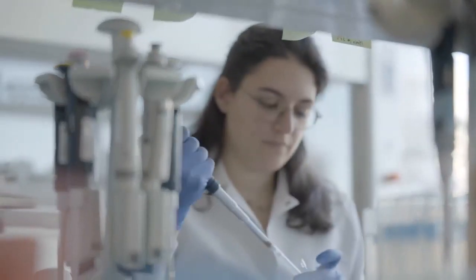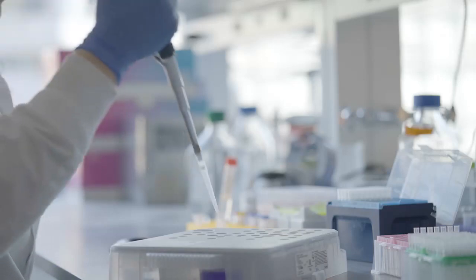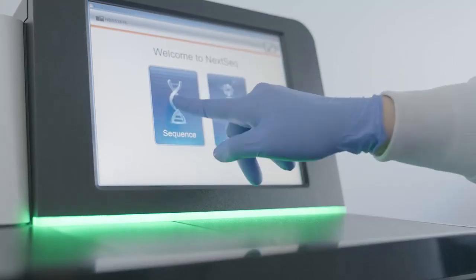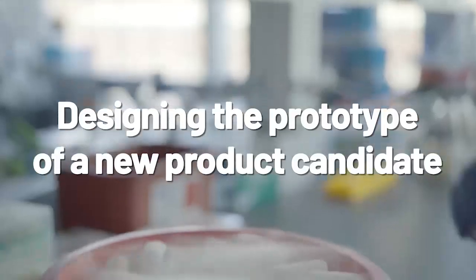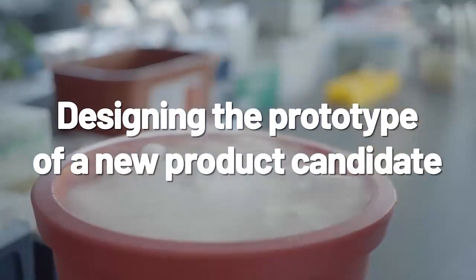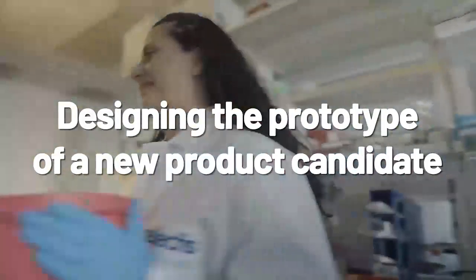We assemble the TALEN, we produce them. Here in New York, we use next generation sequencing, which we have in-house, to test the TALEN from start to finish, from activity through specificity, to in the end pick the best one. And then from that, we generate a large quantity of RNA to then pass on to the next person for future tests in whatever experiments they're doing.